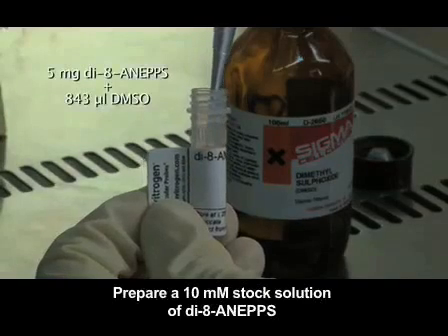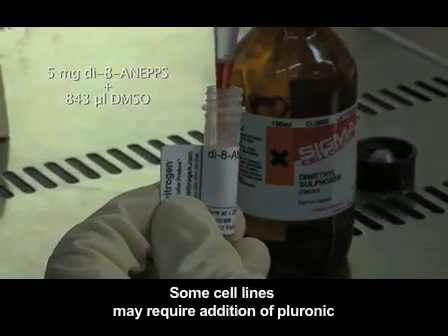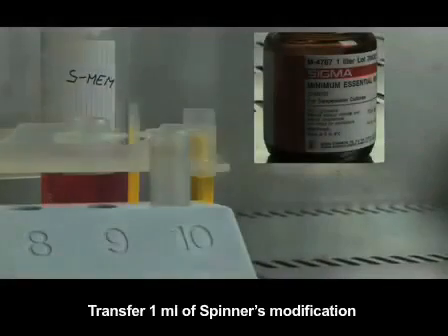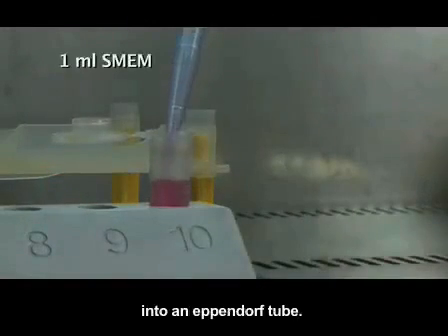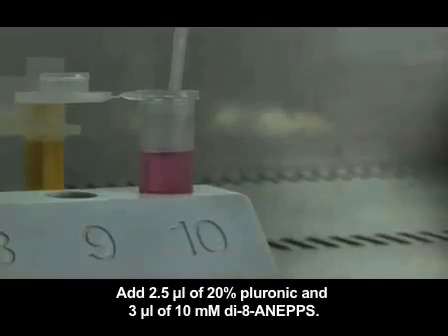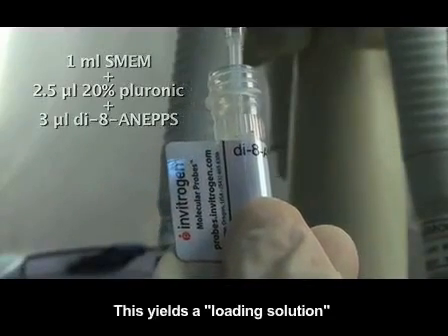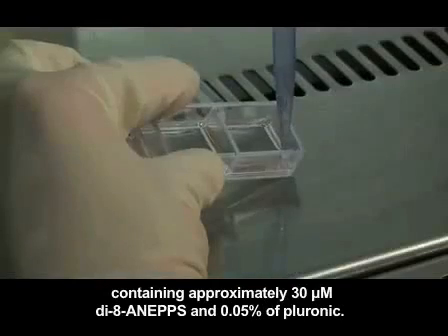Prepare a 10 millimolar stock solution of Di-8-ANEPPS dissolved in DMSO in the original vial. Some cell lines may require addition of pluronic to ease the dye incorporation into the membrane. Transfer 1 ml of Spinner's modification of the minimum essential medium, SMEM, into an Eppendorf tube. Add 2.5 microliters of 20% pluronic and 3 microliters of 10 millimolar Di-8-ANEPPS. This yields a loading solution containing approximately 30 micromolar Di-8-ANEPPS and 0.05% of pluronic.